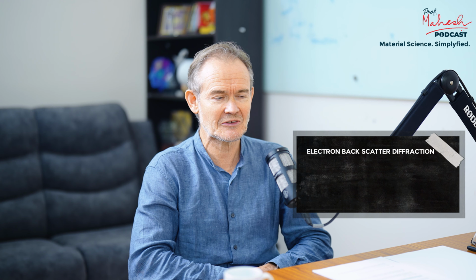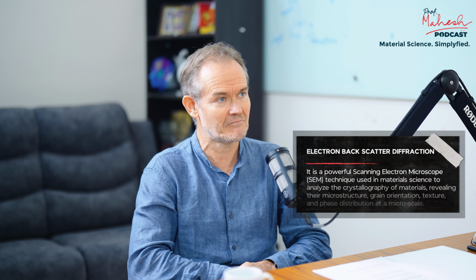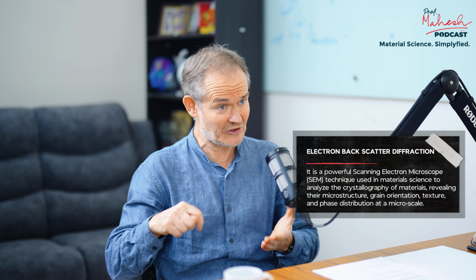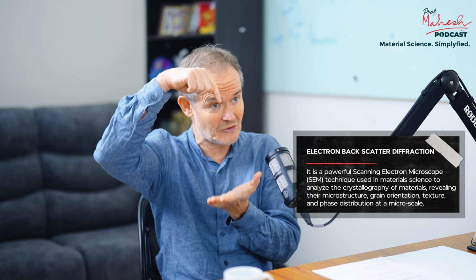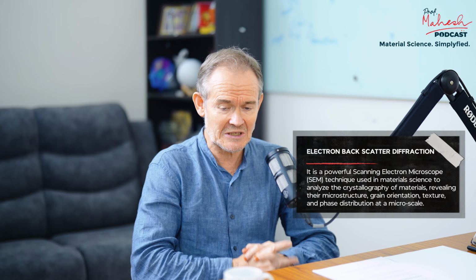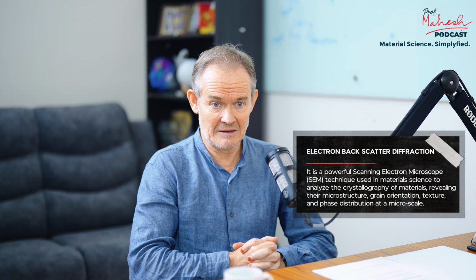EBSD, Electron Backscatter Diffraction. This is a technique which you use mainly in scanning electron microscopy, which is this form of microscopy where you create a beam and at every place you create a signal. Actually, and once again, this is different from TEM where you create an image. So now this EBSD technique is one of the very powerful techniques which is available only for crystalline materials.